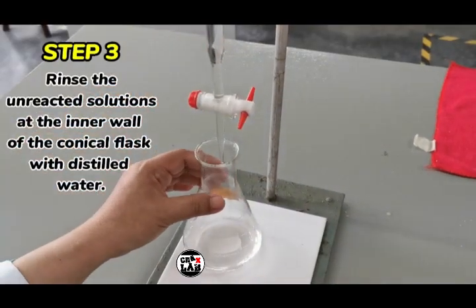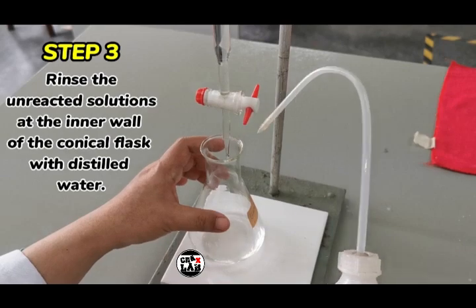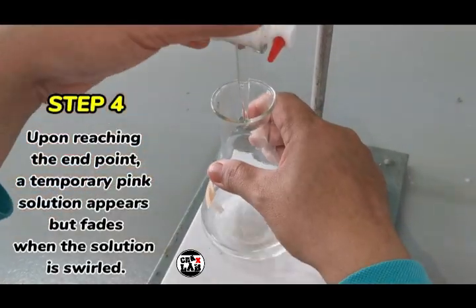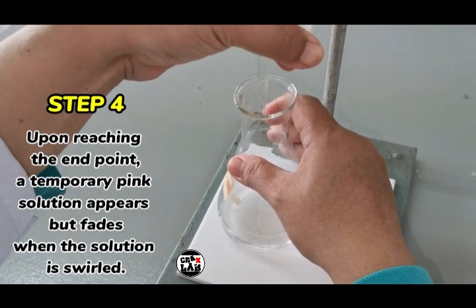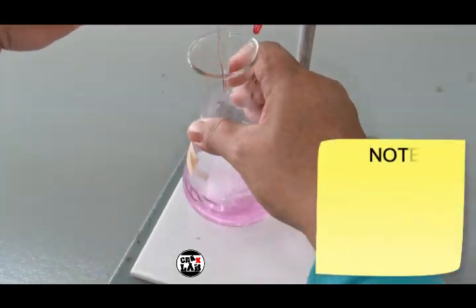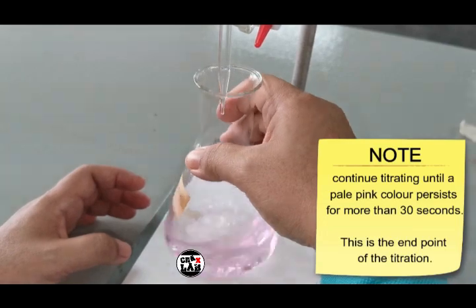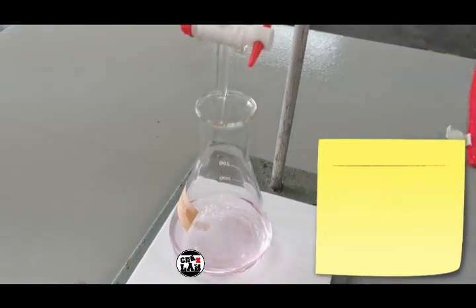Step 3. Rinse the unreacted solutions at the inner wall of the conical flask with distilled water. Step 4. Upon reaching the end point, a temporary pink solution appears but fades when the solution is swirled. Continue titrating until a pale pink color persists for more than 30 seconds. This is the end point of the titration.